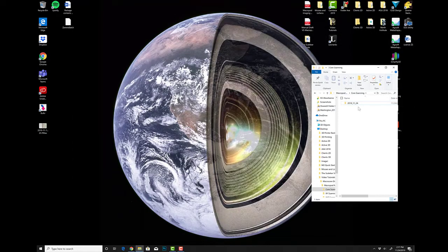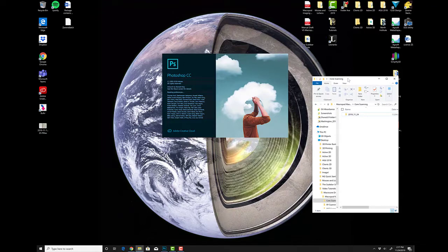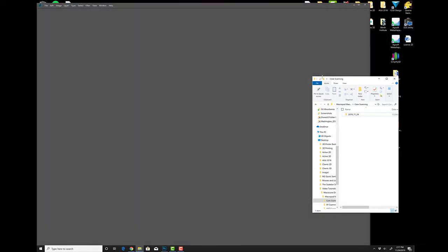Turning off the camera is going to then close our EOS Utility, which is fine because we no longer need it. So we're going to draw our attention back over to the computer where we're going to stitch these images together. To do that, we're going to open up Photoshop. You should have a copy of Photoshop, and if not, you'll need to work with Macroscopic Solutions in order to get a licensed copy. But most institutions generally provide you with one, so this is not something that comes standard with our systems.